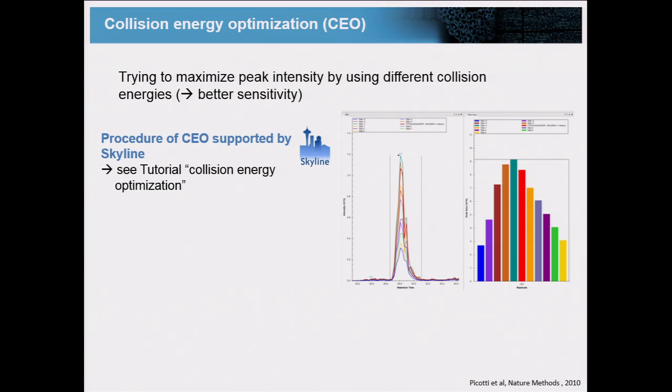So this is the regular formula that was used, and then here, let's say, we reduce the collision energy each time by 2 electron volts, or here increased it, and then what you see here is the total area, how it changed according to the collision energy. So in this case, we were actually working pretty close to optimum, so that's good. But what could happen is that your machine is, for example, tuned around this area, and then basically you're not making the maximum out of your sensitivity.